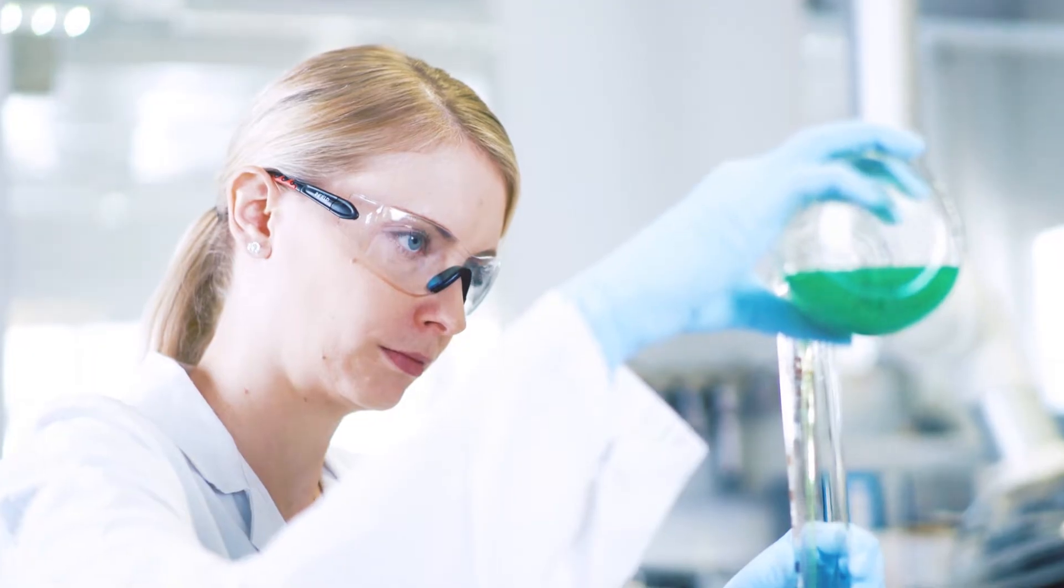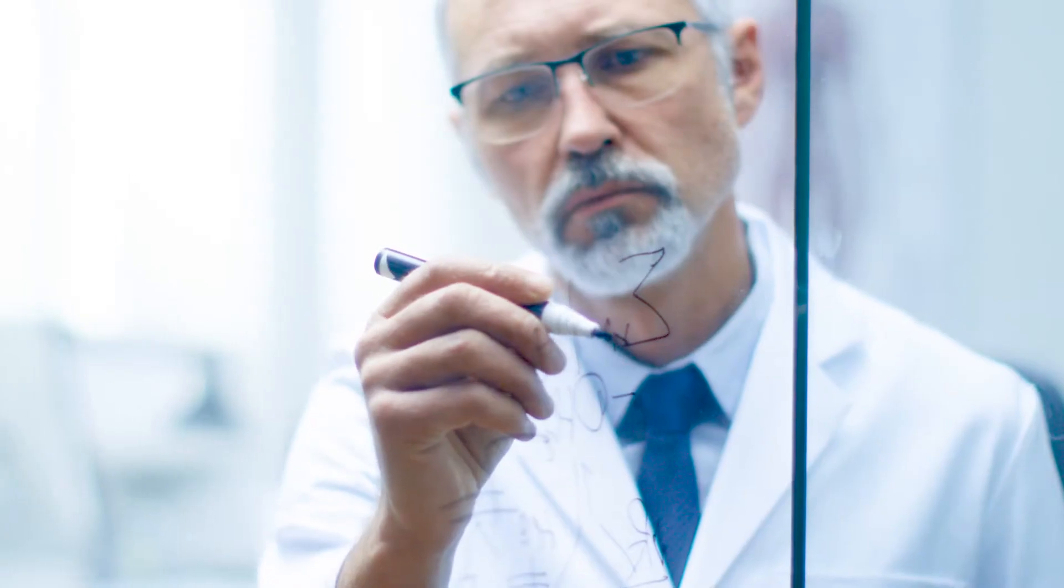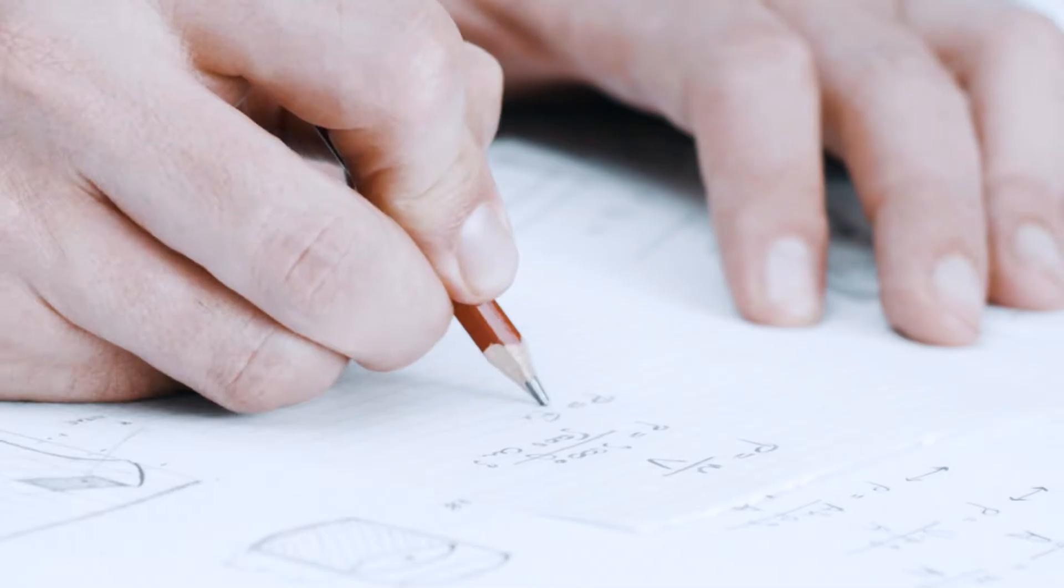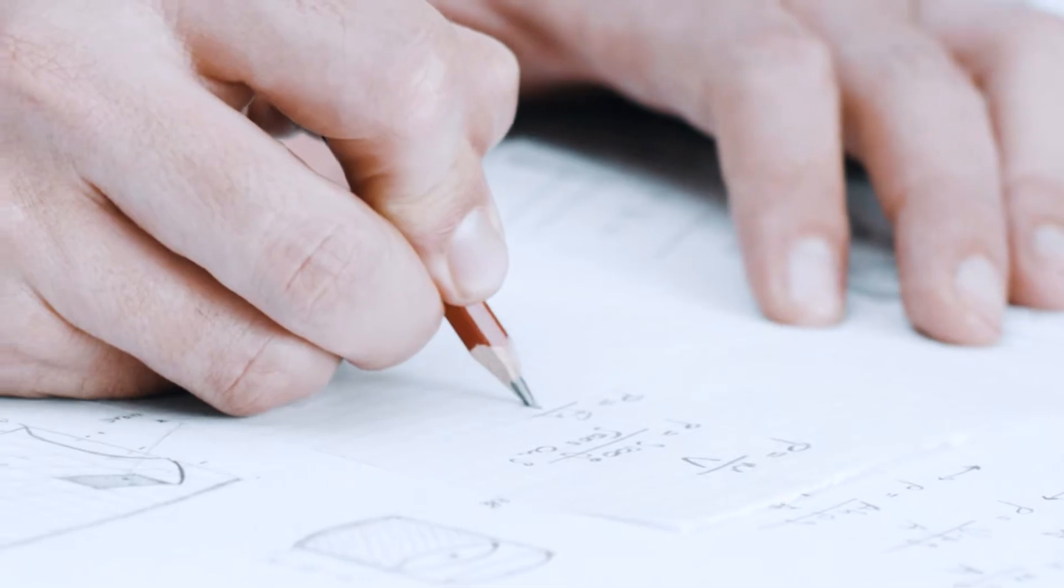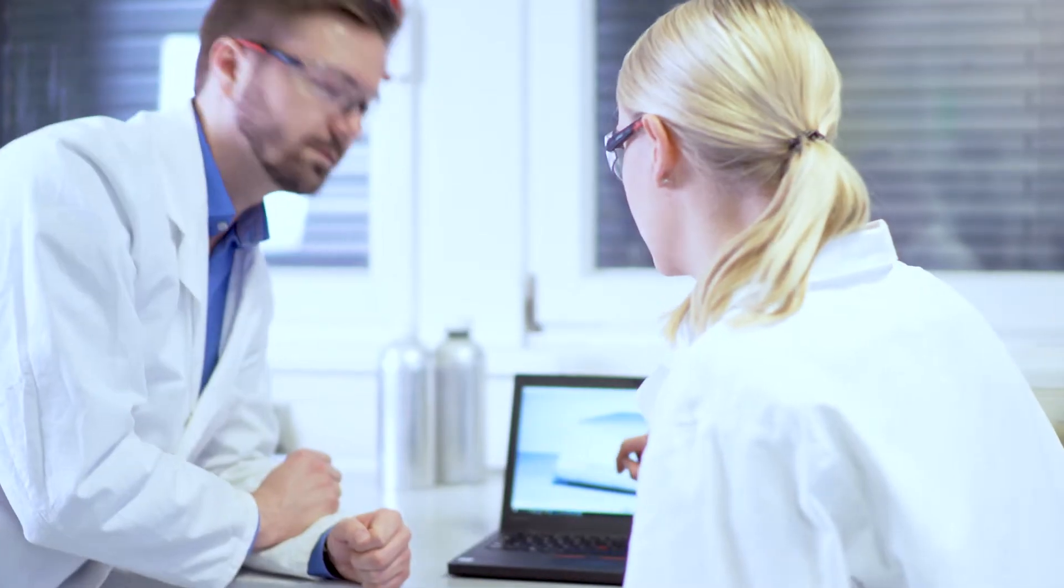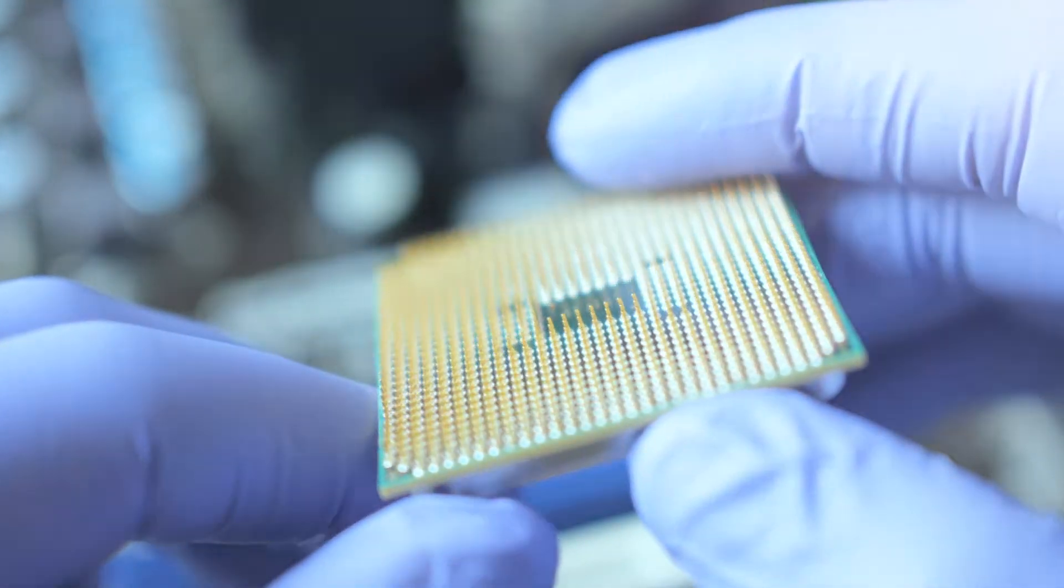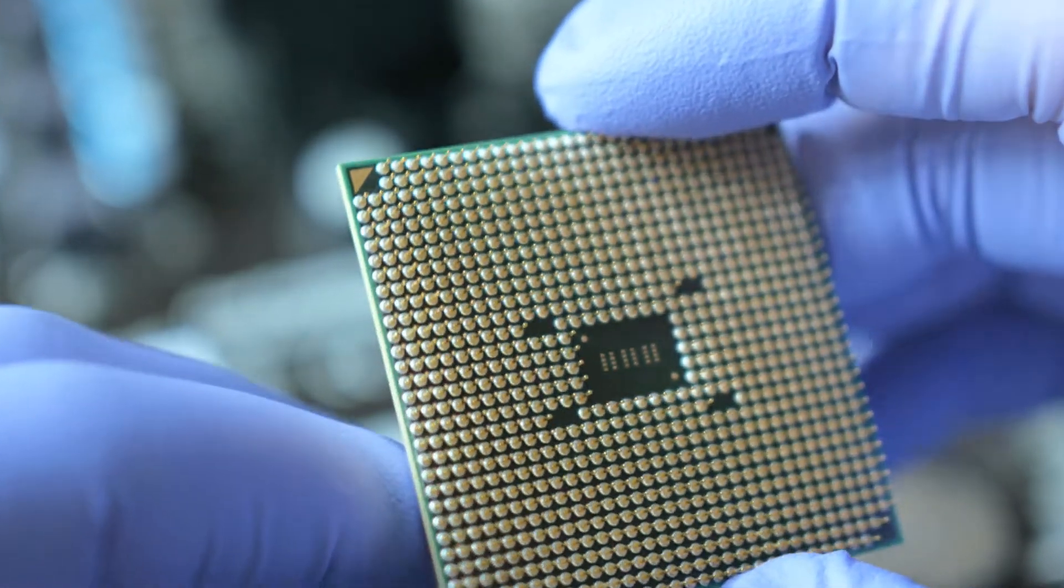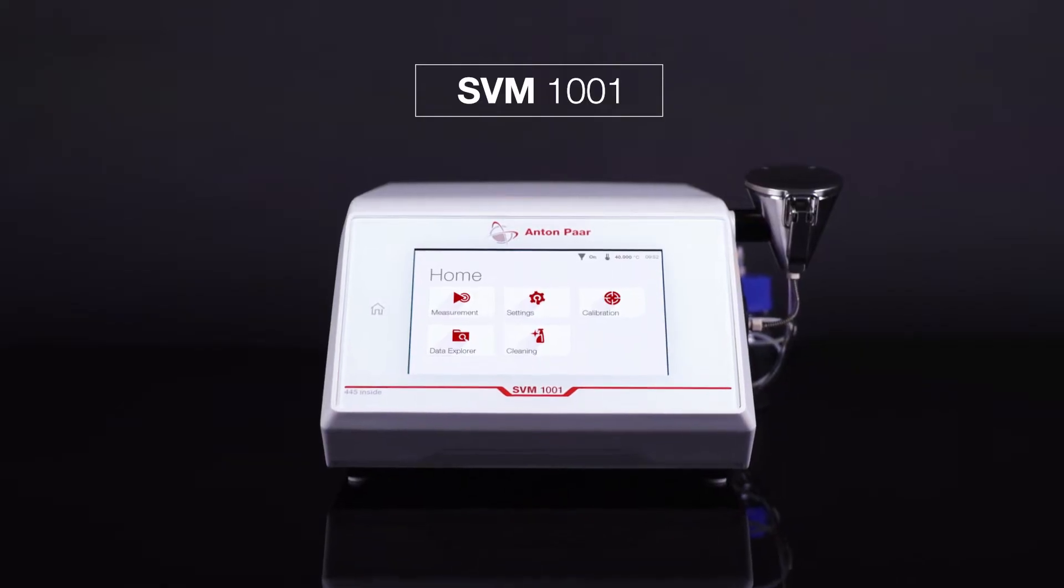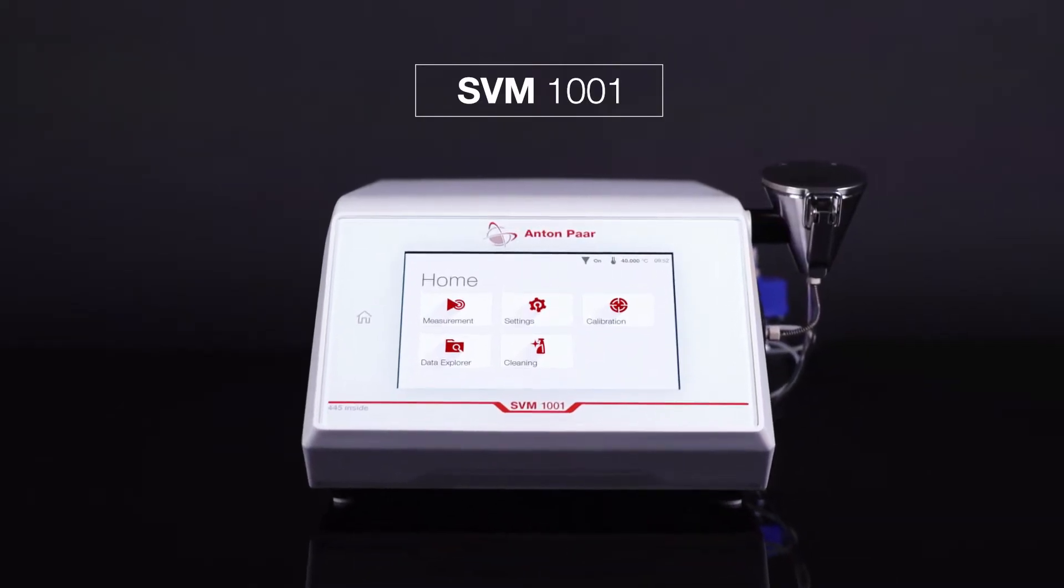Good is the innovator's natural enemy, never smashing conventions, never blazing trails. Good, but not good enough. To create an exceptional new device, we leveraged the greatest attributes of our high-end viscometers and packed them into our brand new compact SVM 1001.